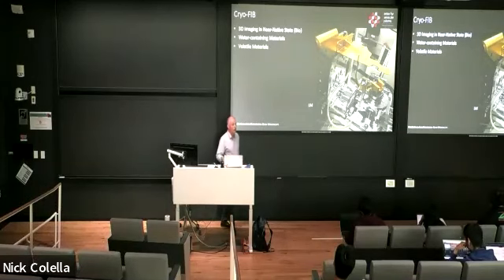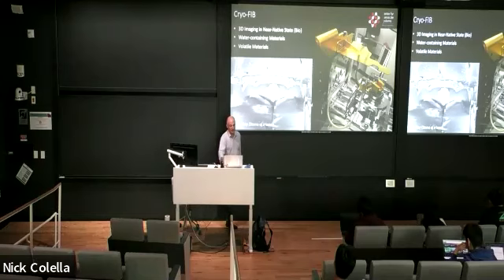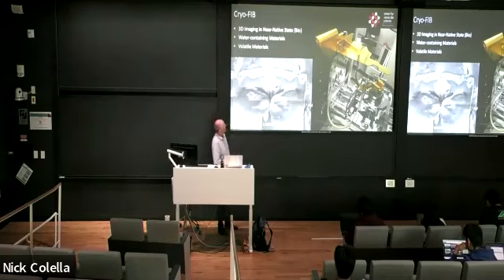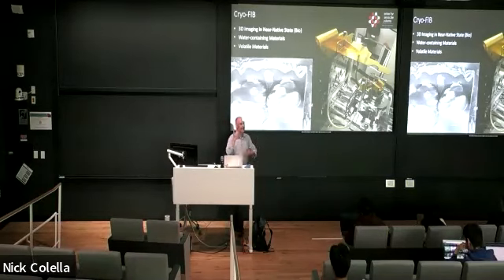Any water-containing material, volatile materials, sensitive material, like lithium that is damaged by the gallium beam. And so this is, for example, an example where we can do a serial section on a stoma of a leaf. And so this cryo-FIB will be the next step of techniques that we plan to develop and make accessible to the users.